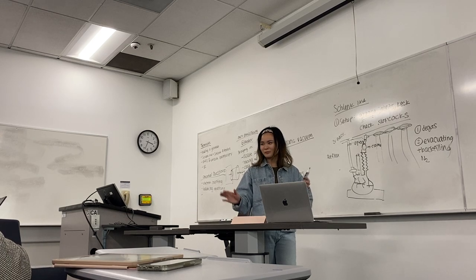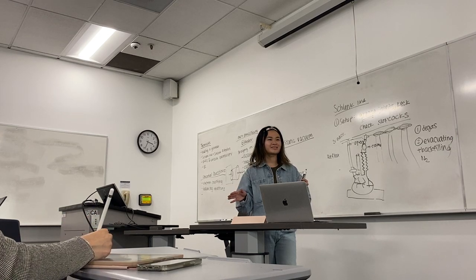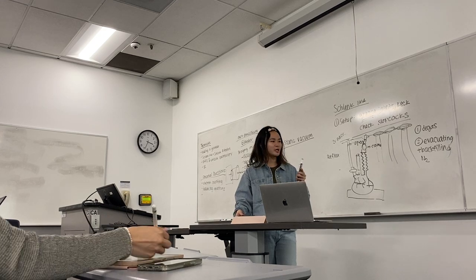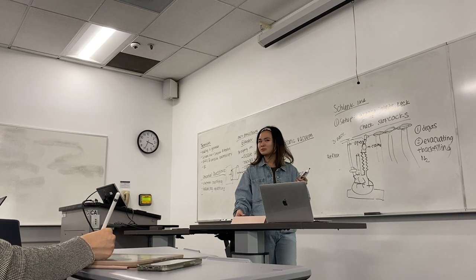Pyrophorics. Everyone know what a pyrophoric is? Fire. I don't think it technically has to be fire, as long as it's flammable. It combusts upon contact with air or water. And you only have one instance of cryogenics, the liquid nitrogen. Yes. Oh, crap.